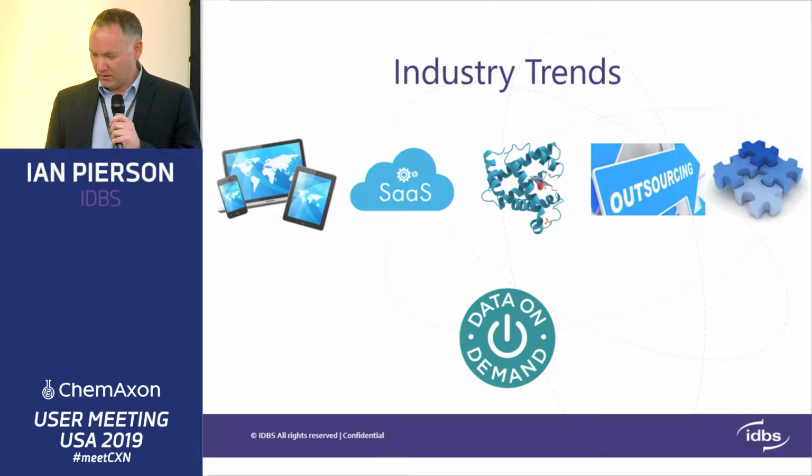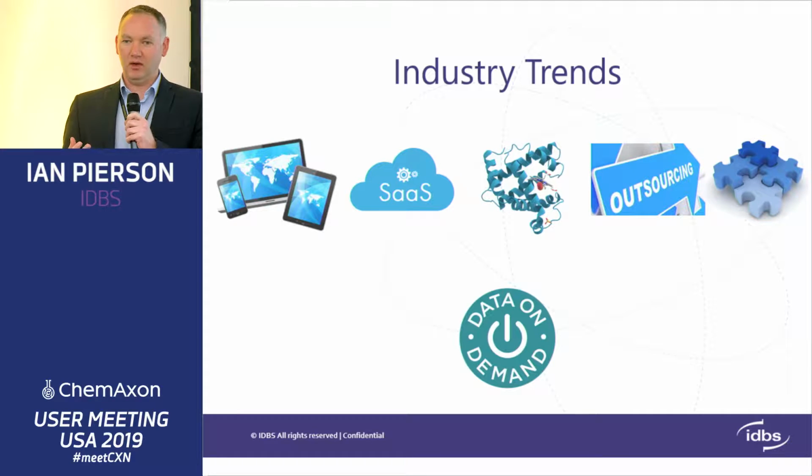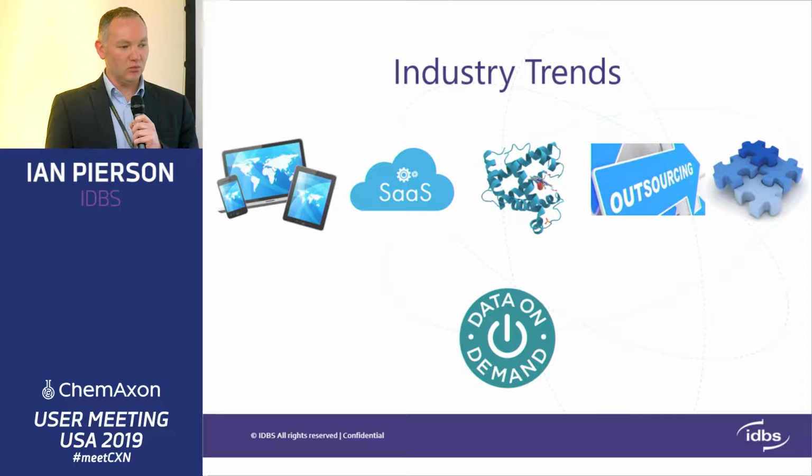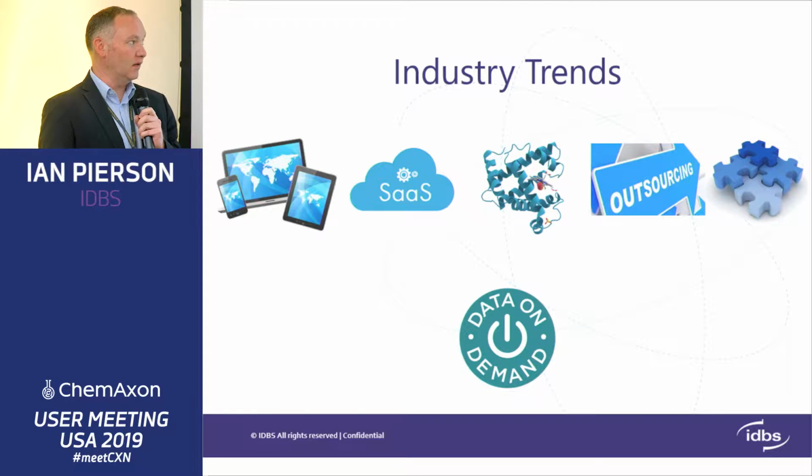I think if you remember historically, IDBS actually had our own IDBS-developed chemistry cartridge, which we had in our desktop product, and we chose to replace it with ChemAxon's technology when we developed our web application. And that was very powerful because effectively it provided us with a lot of core capability and features which we could leverage quite quickly and easily.